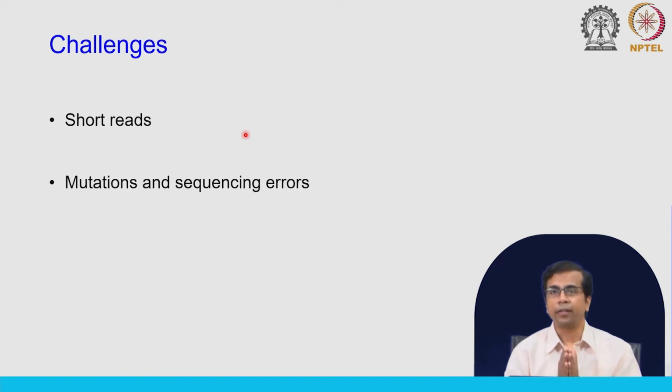You can imagine this mapping problem as string matching. You have this read, which is a combination of letters, A, T, G, C, and on the other hand you have the reference sequence, which is also a combination of letters A, T, G, C. At the end, mapping is string matching, where there is a perfect match in the genome.